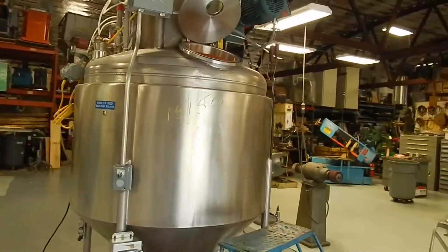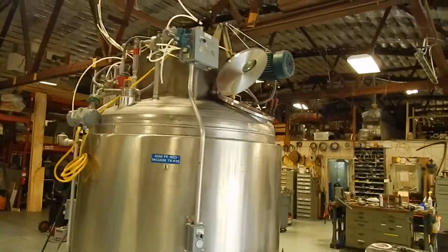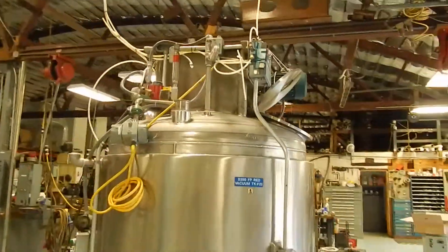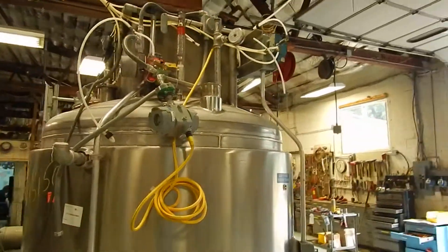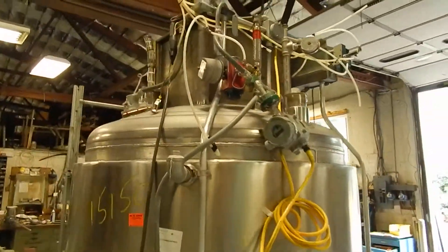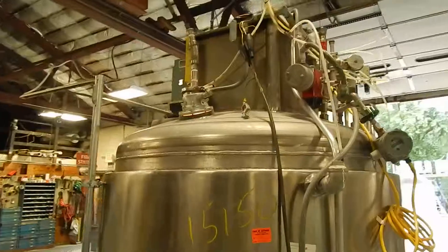We're under power right now and I'm going to show you some of the features. It has a large 5 horsepower drive with gear reducer, then goes to a 4 to 1 bevel gear reduction in the top stainless box mounted up there.